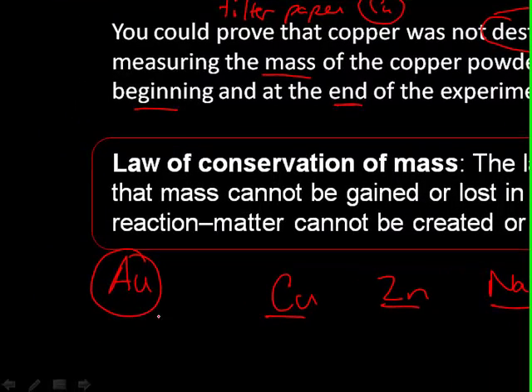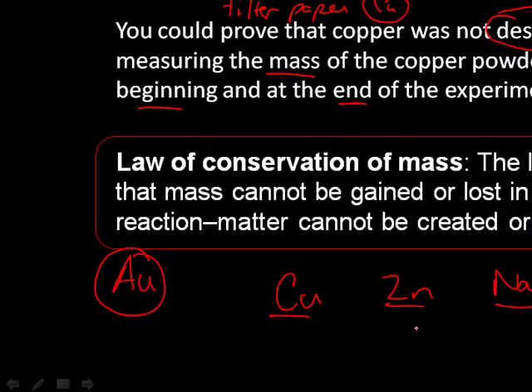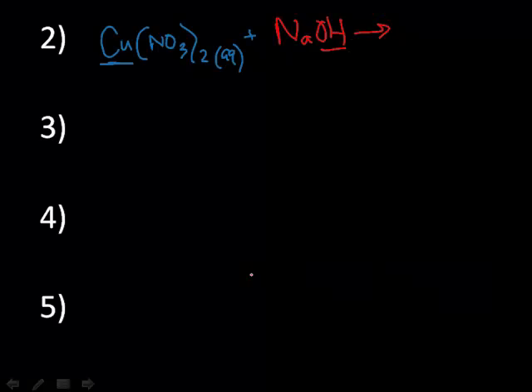So that means our golden penny has to be some mixture of the copper and the zinc. If gold is an element, then we probably would not be able to convert copper into gold by reactions similar to those carried out in the copper cycle lab, because elements cannot be created or destroyed by chemical means.